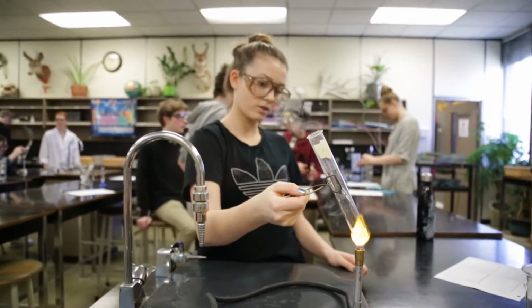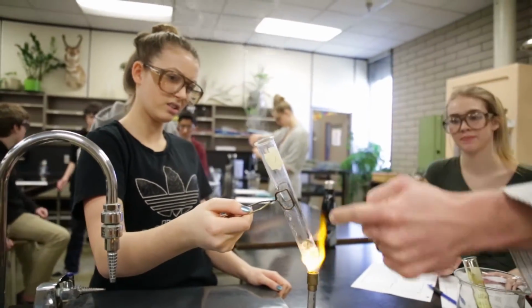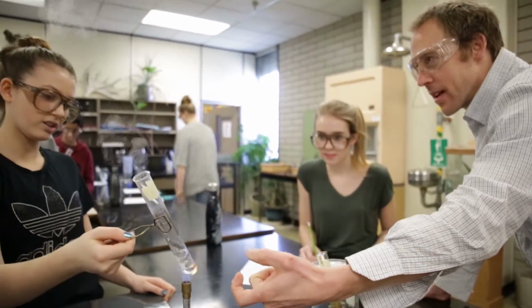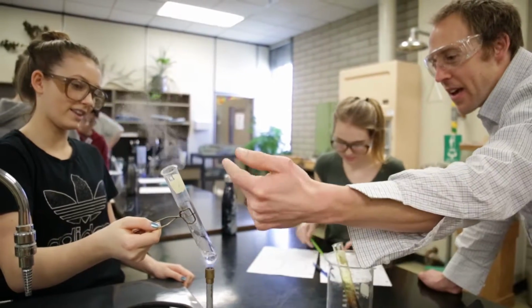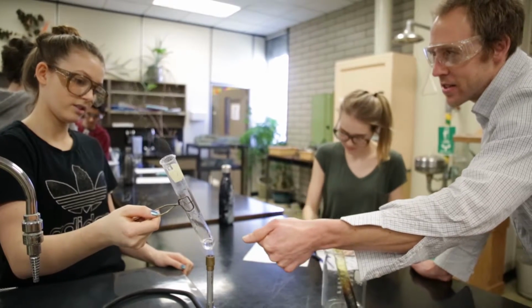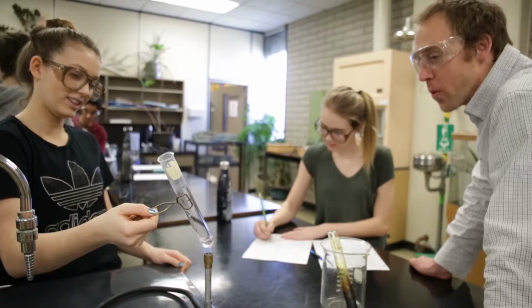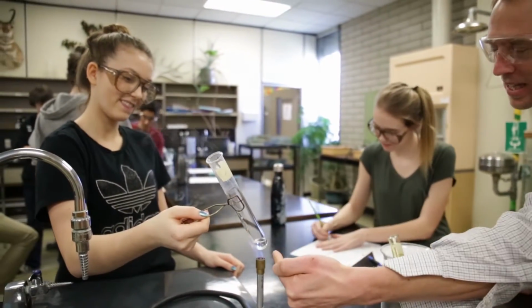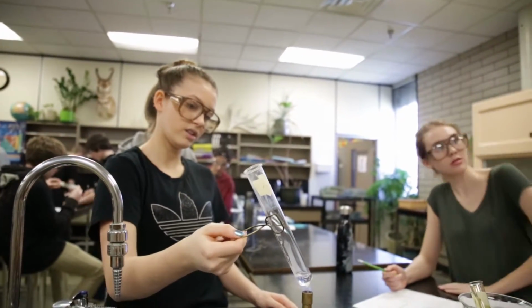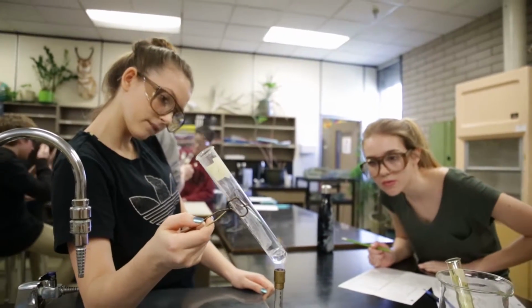So now, why do you think it's really orange? What has happened? Water on it? Yes, probably. The liquid is on the outside of this, right? And so therefore, why is it orange? It's making it wet. Okay, but if this is outside of the test tube, then this is flammable, burning. Exactly. So it's burning whatever's on the outside of the test tube. It turned a little bit cloudy and it's definitely evaporating.